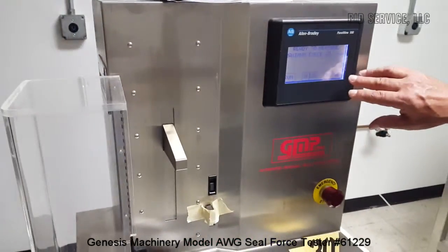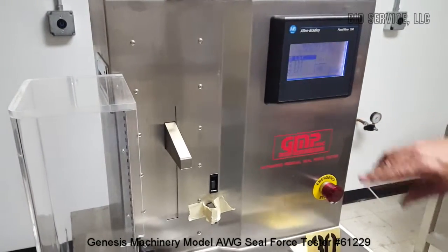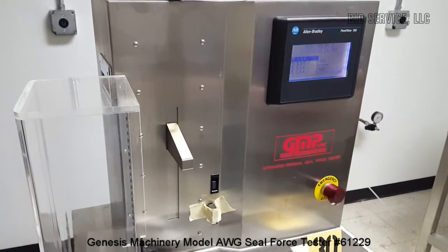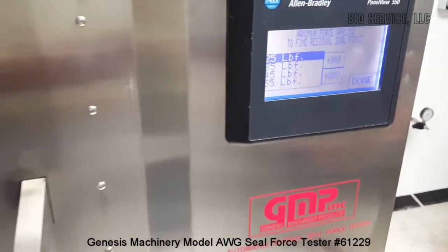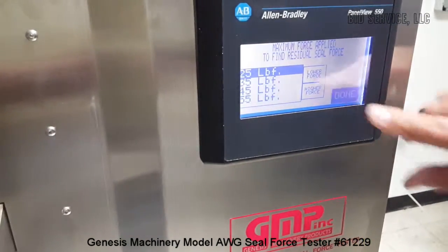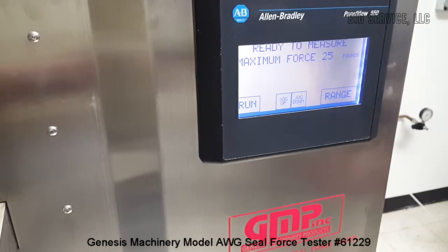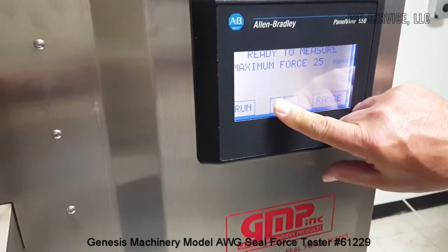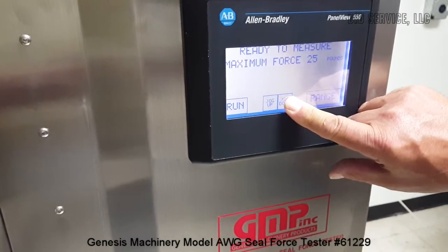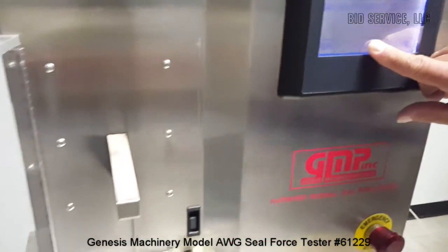It also has a range function where you tell it the range that you want to do your testing with. It also has jog up and jog down buttons, as you can see here.